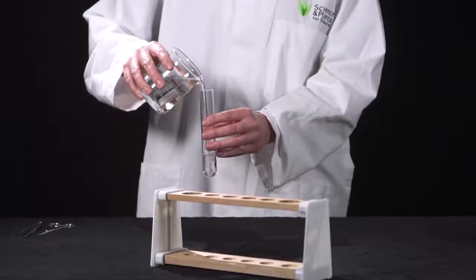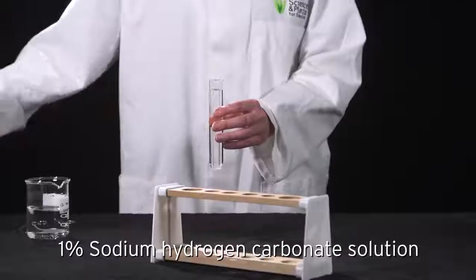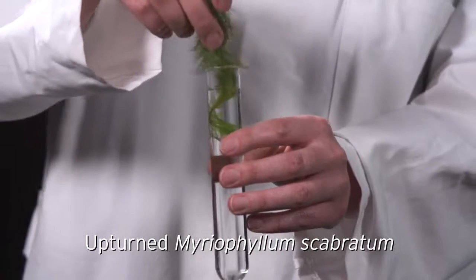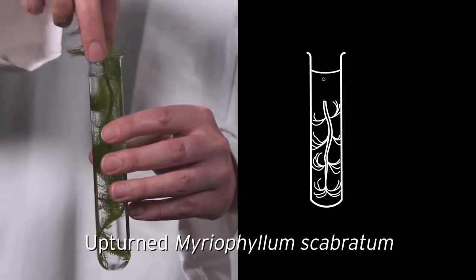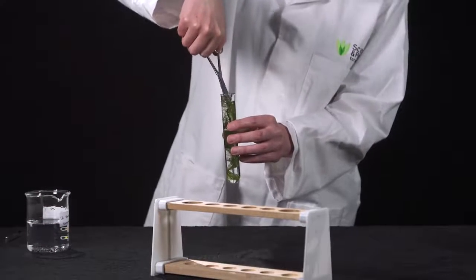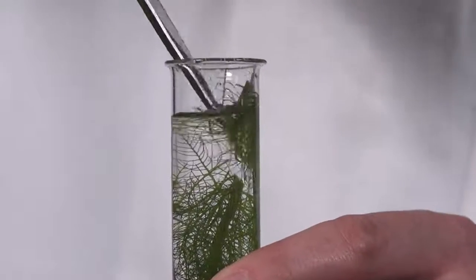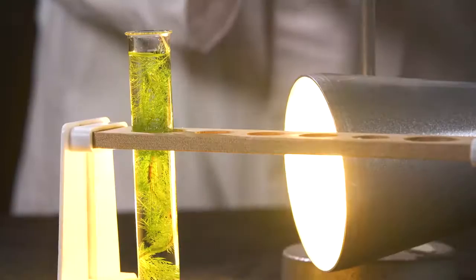The bubbling pondweed setup is versatile and can be used in different ways for different groups of students. It can be set up by simply filling a boiling tube with 1% sodium hydrogen carbonate solution and placing a piece of pondweed in it, cutting the stem under the level of the liquid. Cutting the stem at an angle under the surface of the liquid is important because it stops an airlock from forming, which would stop bubbles from being able to escape.